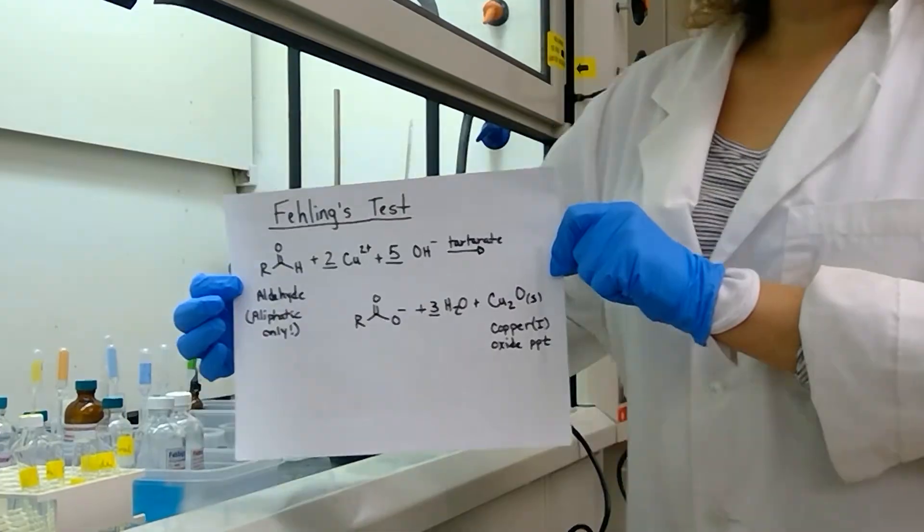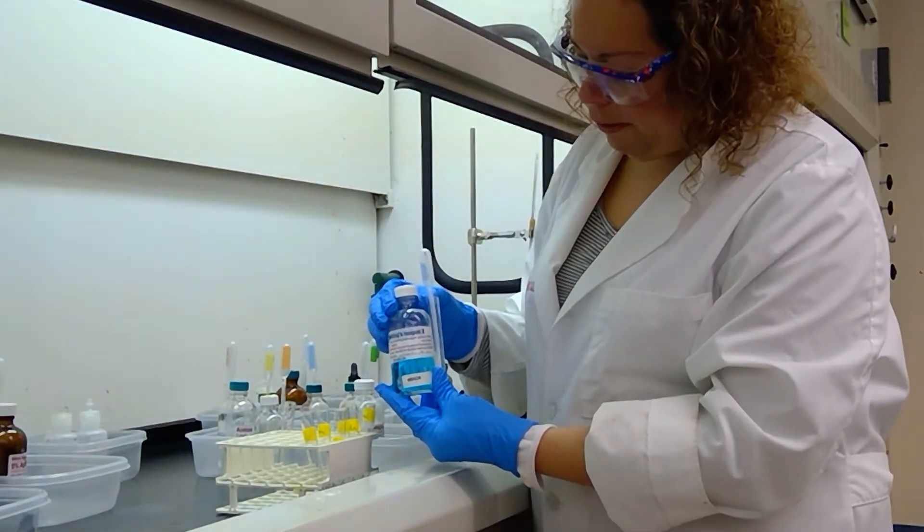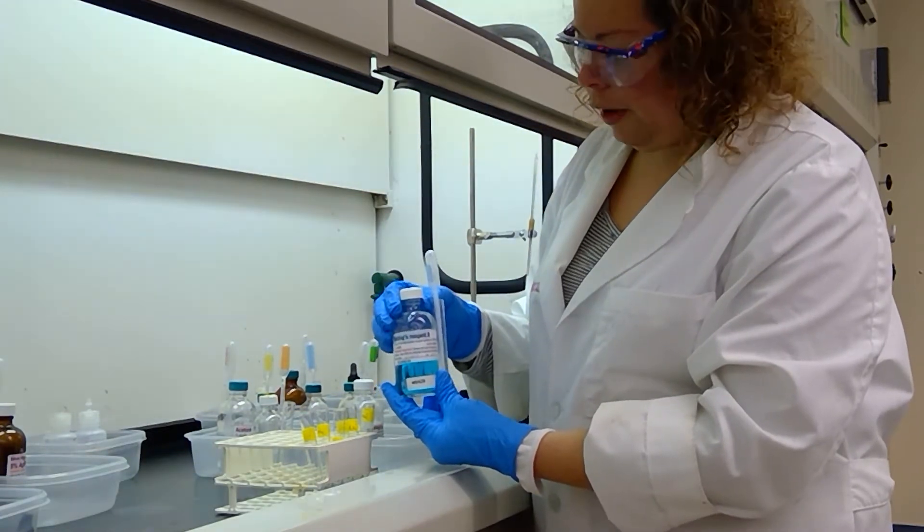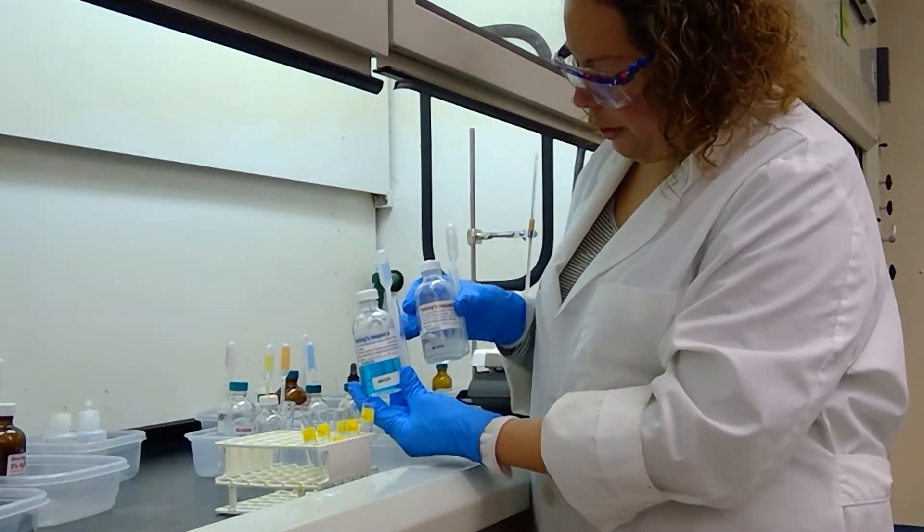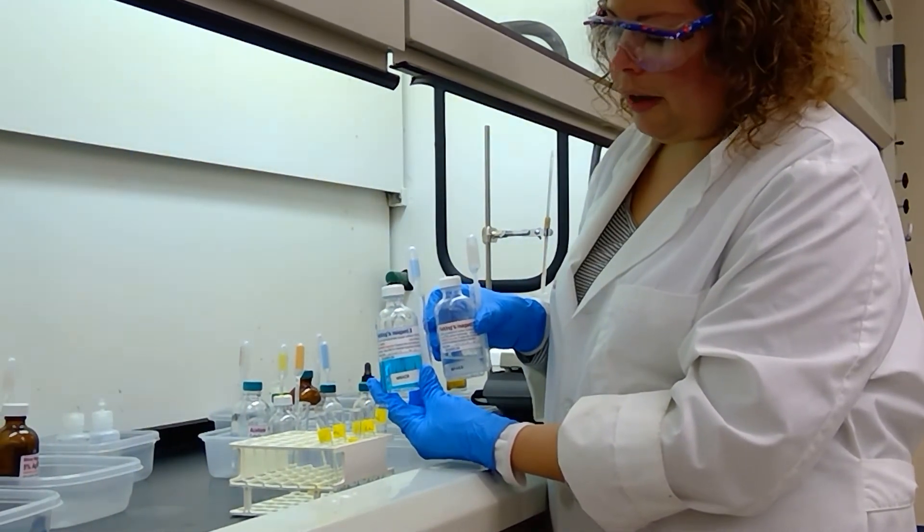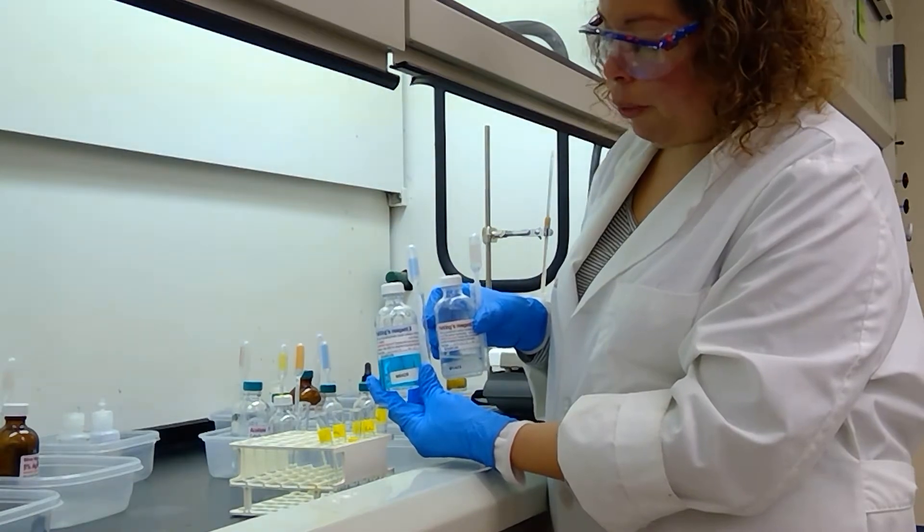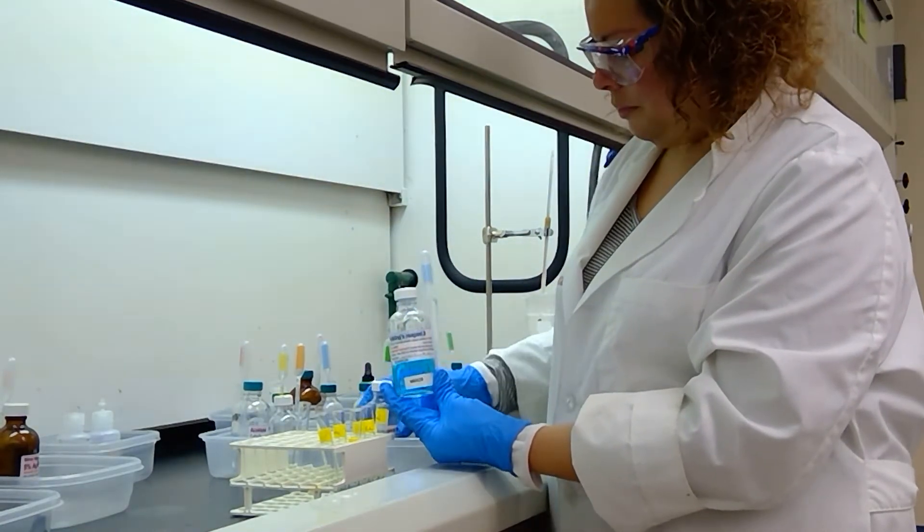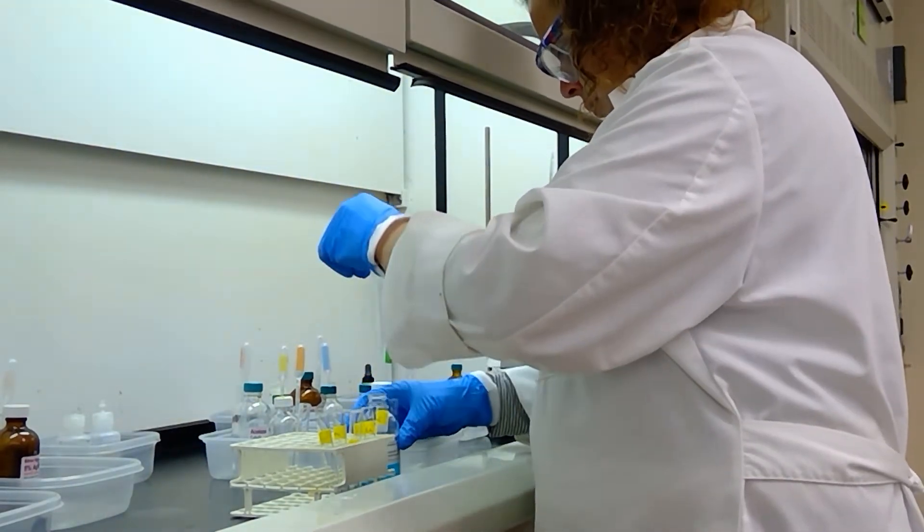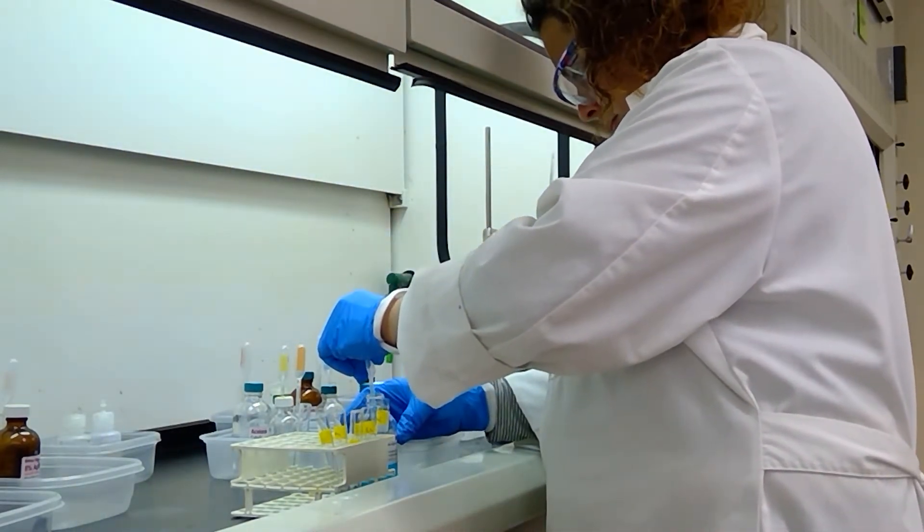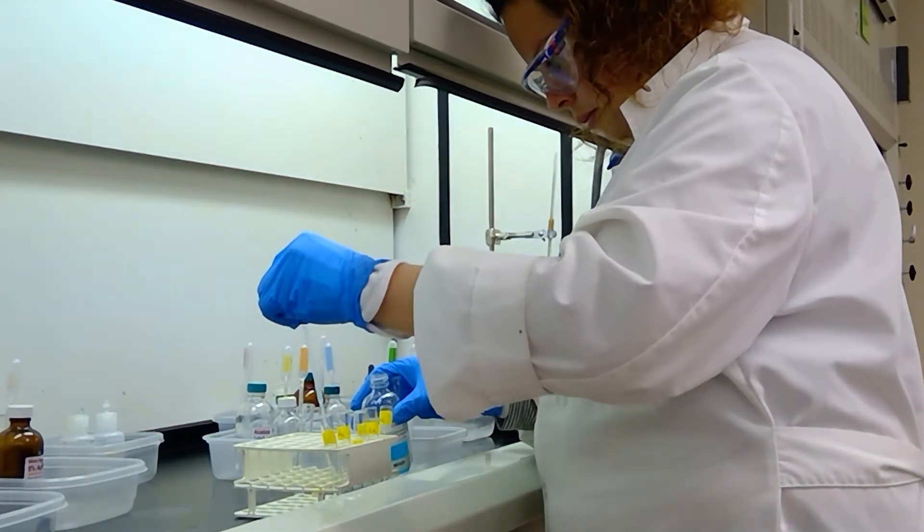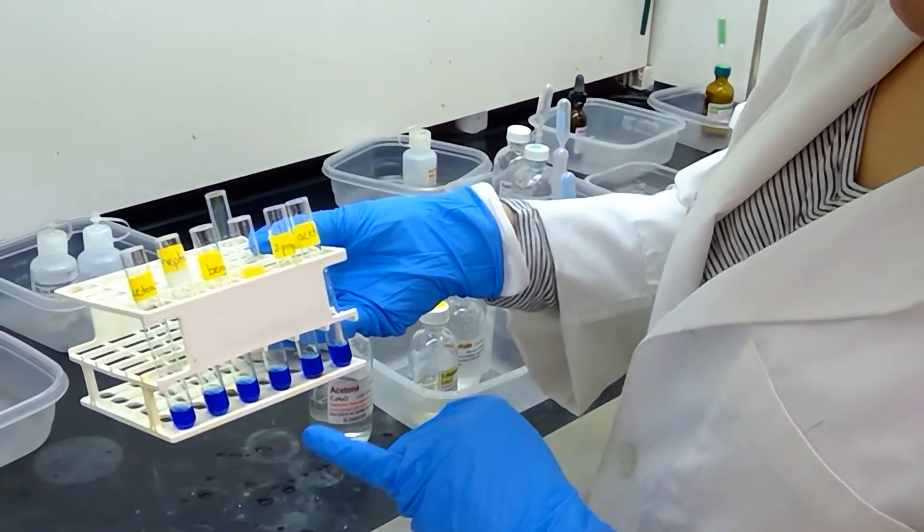We are first going to add 0.5 milliliters of Fehling's reagent A to each of our test tubes, and then we will follow that up with half a milliliter of Fehling reagent B. These two compounds cannot be pre-mixed because they will cause a reaction before we want them to.